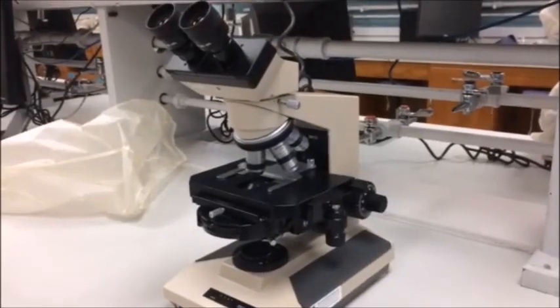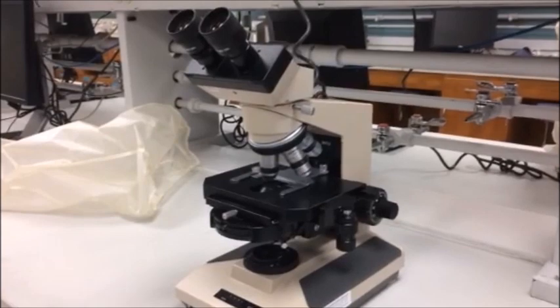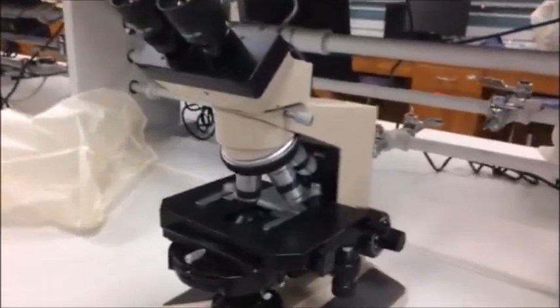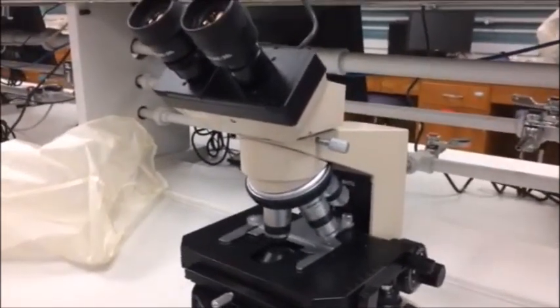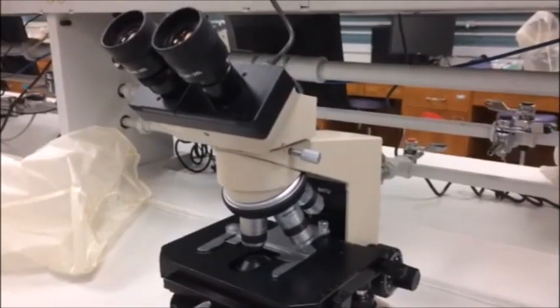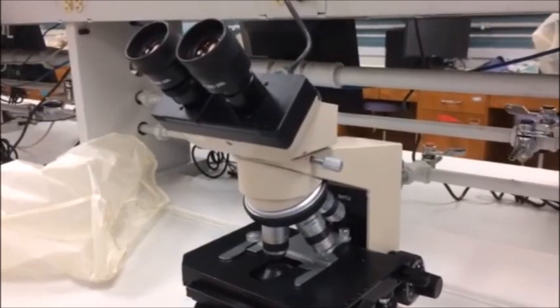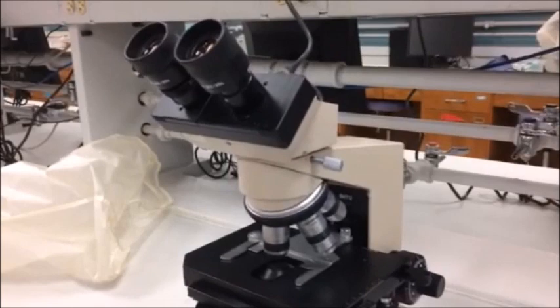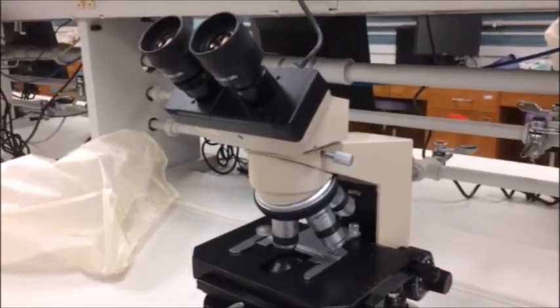Your major task this week is going to be to learn how to use and adjust these compound microscopes. They are actually pretty awesome microscopes in terms of the quality. What is not awesome about them is that they are not particularly user-friendly. It's possible to use them and not go through all the adjustments you're supposed to go through, but the quality of the image that you get will be a lot worse.